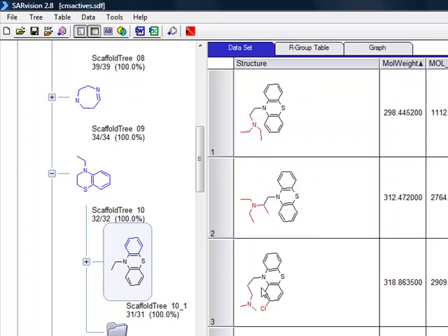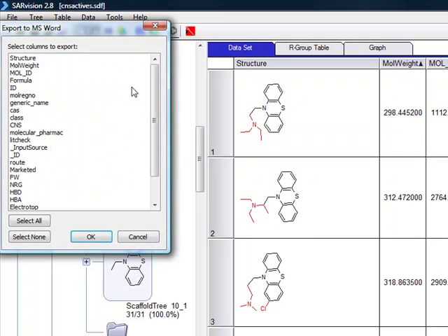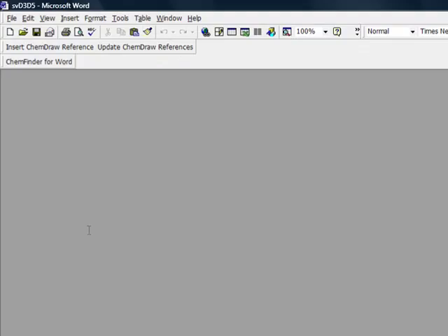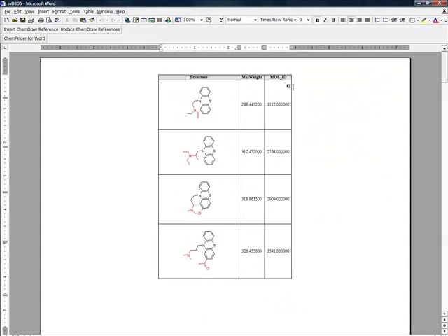You can fully edit the table and once you're ready, with a click of a button, this table of molecules can be exported to Microsoft Word for generating project documents or lab reports.